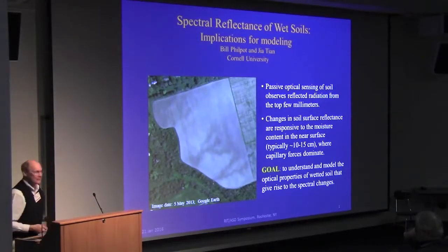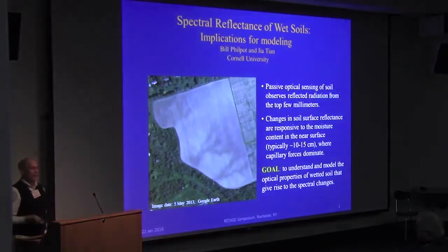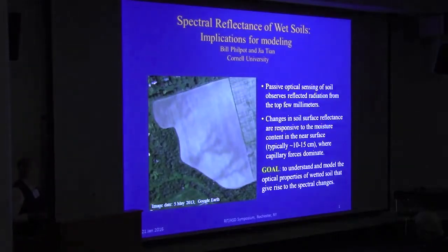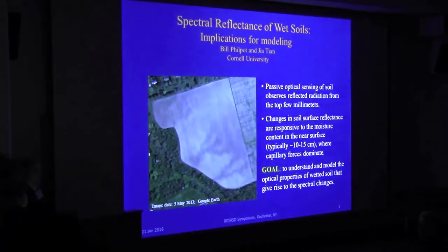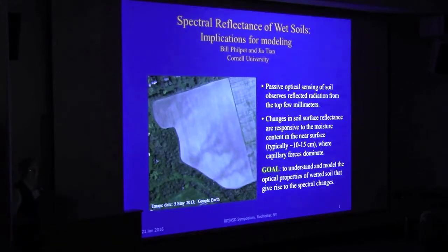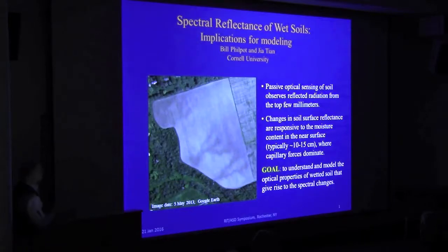Something that occurred to me is when I was a graduate student in oceanography, I wanted to do field spectroscopy and called around to companies, and this is in the 70s, to see if I could find one. And it was met generally with about 5 seconds of absolute silence because they did not exist. I really do appreciate these instruments. As a note. Okay, yeah, I'm interested in how wet soils affect spectral reflectance.